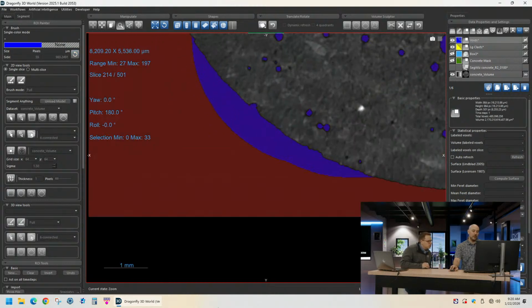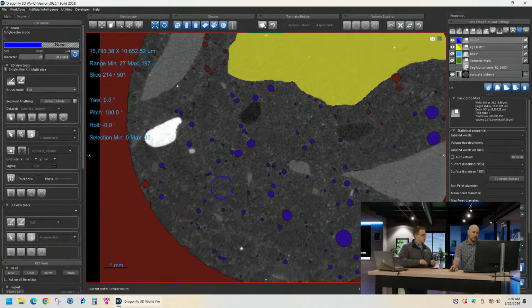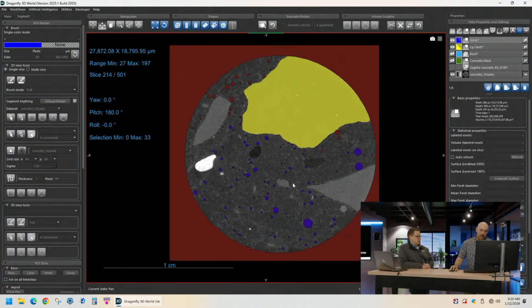And it does, like right there, what we saw is it doesn't take the whole region, but because you're using the painting tool, it only paints the region that you touched. Right. So this is kind of a nice little feature. I love using this. Yeah. That's a nice little feature to have.